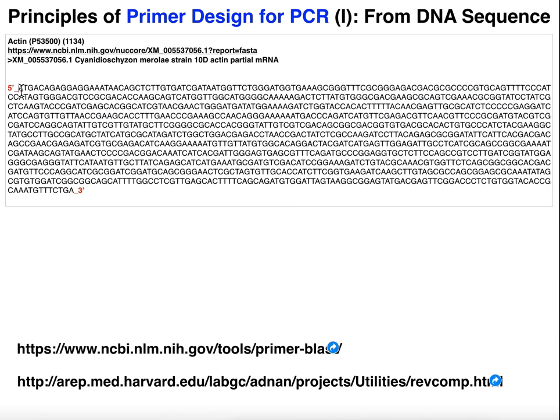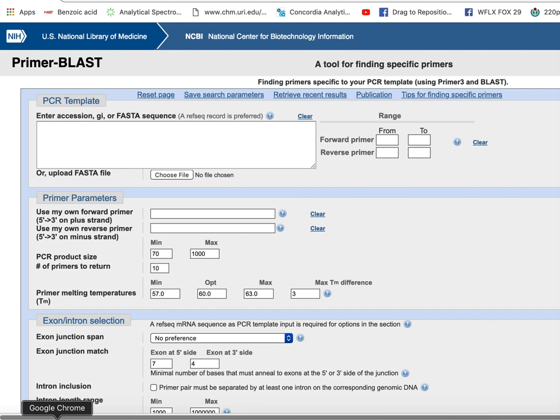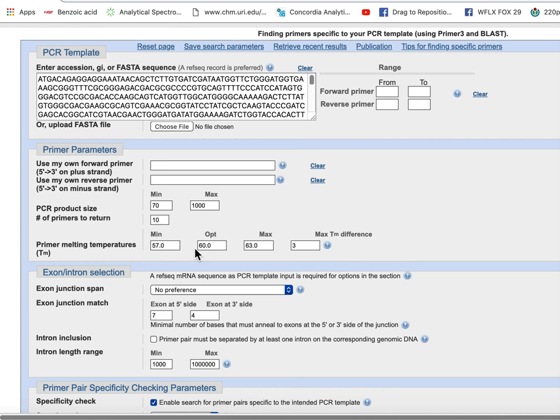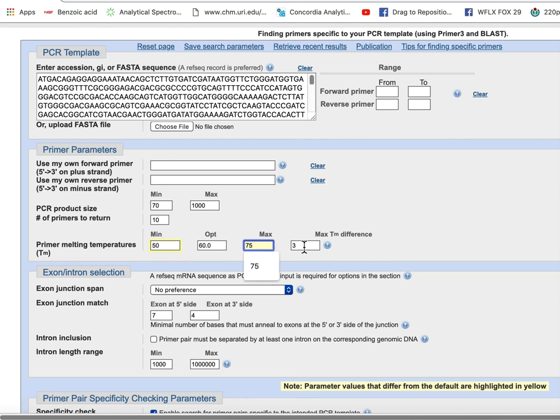So here's our entire sequence that we want to amplify. You can choose the PCR product size — for example, with these parameters, the particular segment of DNA that gets amplified would have a minimum of 70 nucleotides and a maximum of 1,000. It also tells you how many primer pairs to return in the results, and down here you can change the minimum, maximum, and optimum melting temperature, as well as the difference between the max and min.